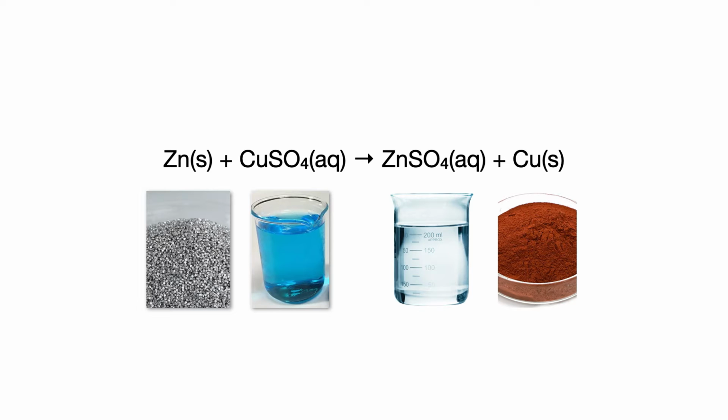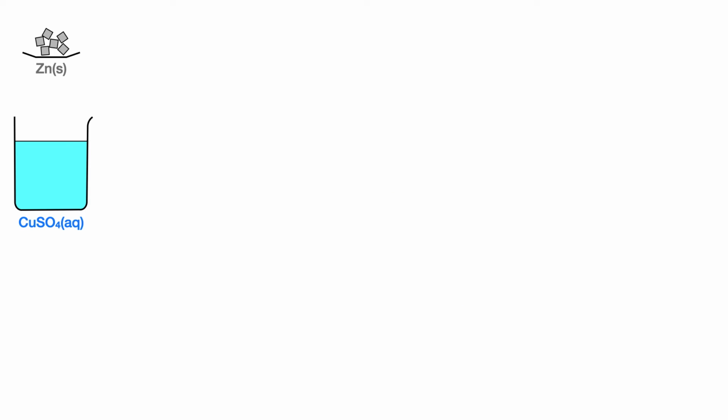The zinc metal dissolves and the blue color of the copper sulfate solution fades as the copper is converted into copper metal, and the copper metal falls to the bottom of the beaker. So here's a simple animation that I put together showing this reaction.